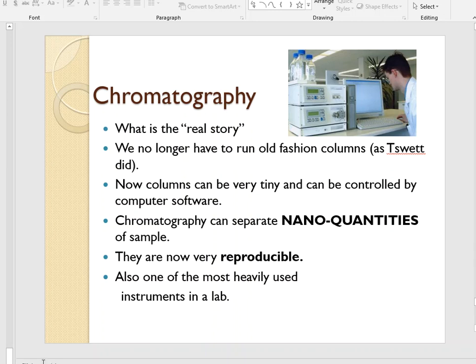All right, so that's it for Intro to Chromatography. As far as the instrumentation goes, this will turn off into another direction where we'll talk about pieces and parts, and we'll talk about the actual equipment itself a little bit later on. But as far as the general concept of chromatography now, I think that you've got it. So these are a few equations, a few terms that we will go through and talk about throughout the entire course. We might as well introduce them now, so that when we do talk about them in reference to the equipment, you won't be lost.